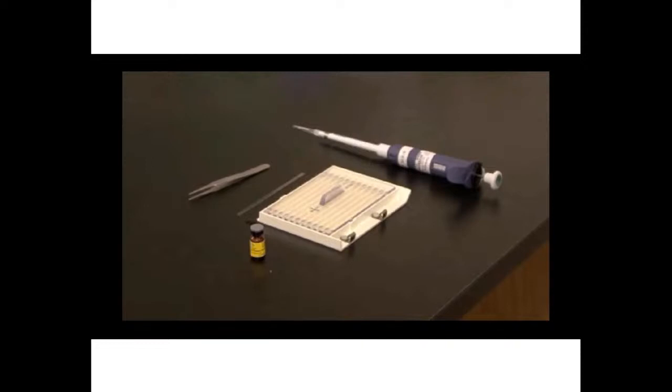Now we are ready to place the IPG strip into the focusing tray. An IPG strip has two sides. One is a plastic protective backing and the other is a dried gel. You begin by removing the plastic protective backing with forceps, and you can tell where that plastic protective backing is by a slight indent on one side of the plastic pieces. The side that has the indent is your protective backing. You pull that rapidly across, and now you have gel side up.